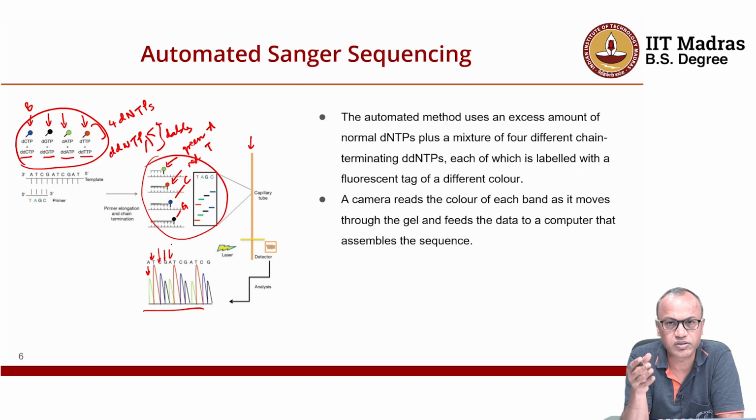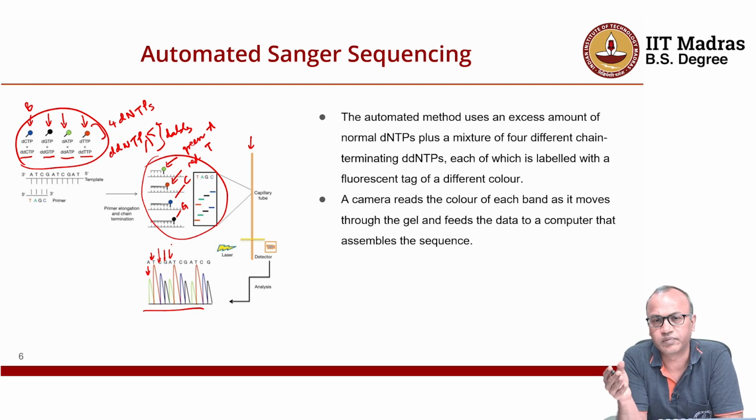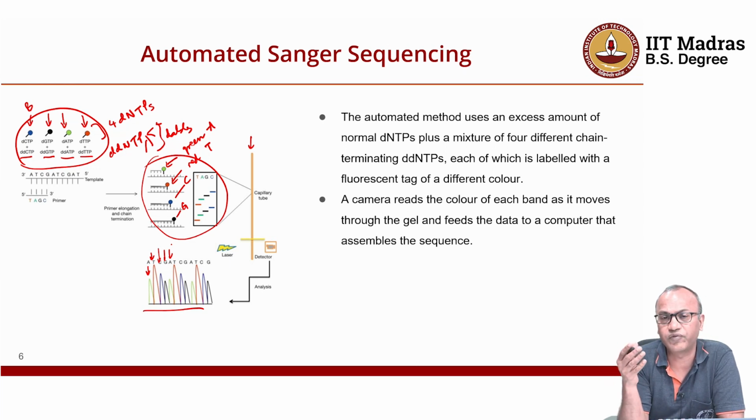And actually Sanger sequencing is very much still used these days, especially for shorter reads. For example, in many labs we do these short read sequences when we are trying to determine whether we have cloned the gene correctly in a plasmid, or whether, when we did this CRISPR-Cas mutation, the right mutation has been inserted at the right site. We do Sanger sequencing. We even do Sanger sequencing for the spike protein in COVID.